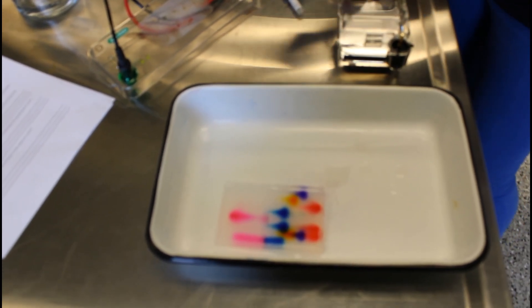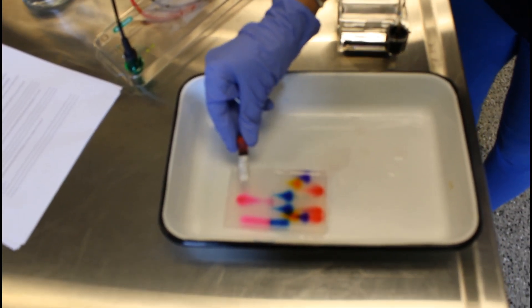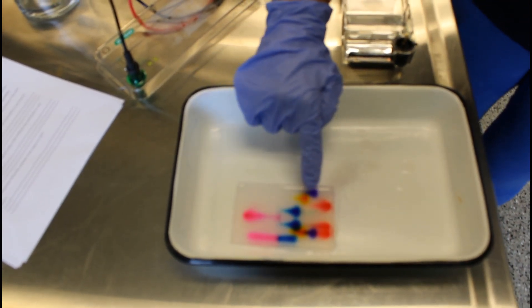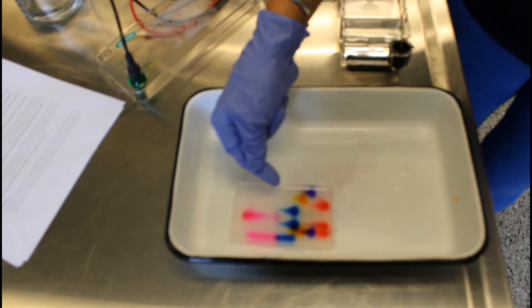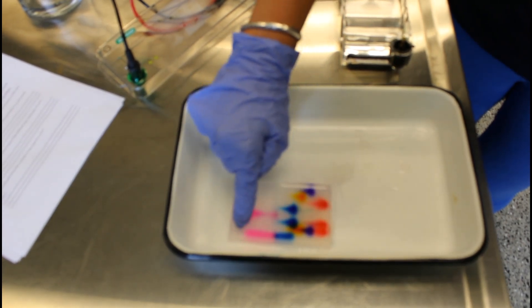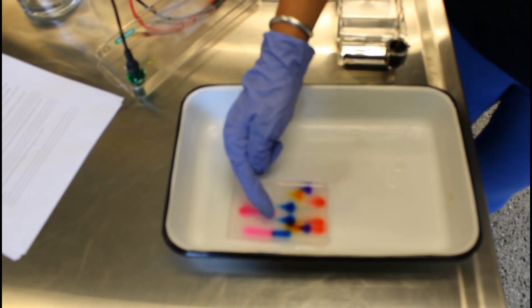And then our last known dye was this PY. And so this was the one that was moving in the opposite direction towards the negative electrode, so this one must be positively charged. And so now your job is to look at this signature, look at what happened to these known molecules in the first one, two, three, four, five lanes, and then use that information to determine what combination of these known dyes was in unknown number one, unknown number two, and then in the last row or in the last well, unknown number three.